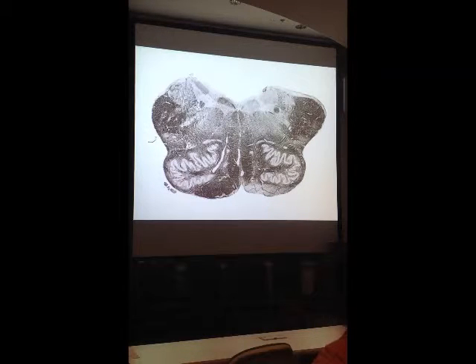I'm not likely to ask you on this slide, 11, the hypoglossal nucleus, even though I think it shows quite well, there's evidence of axons streaming down in this direction. Or I'm not likely to ask you the dorsal motor nucleus of the vagus. I told you that last week in one of the reviews that I did. In any event, I wouldn't worry too much about the nuclear array in the floor of the fourth ventricle. Just realize all this area here is cranial nerve nuclei. Okay? Now, the final slide.